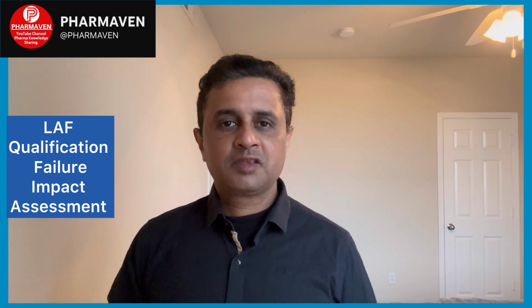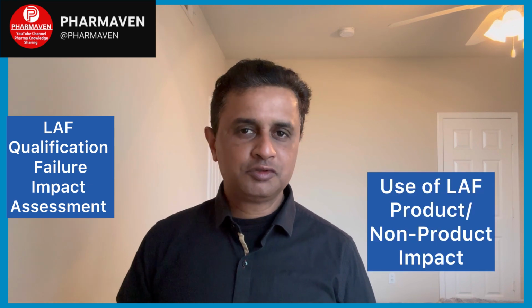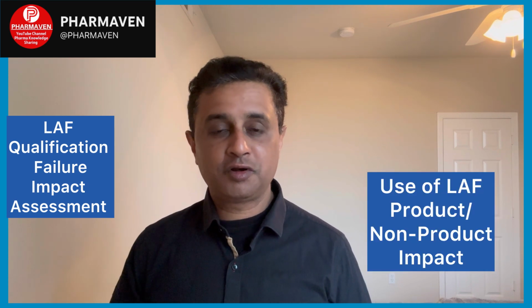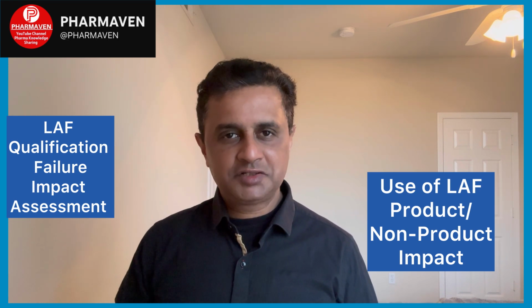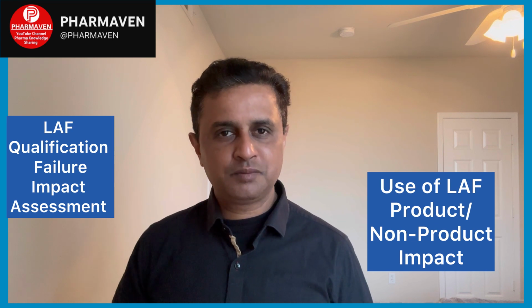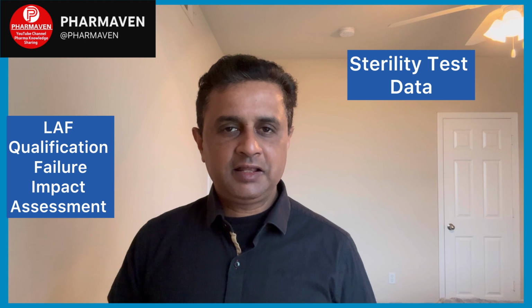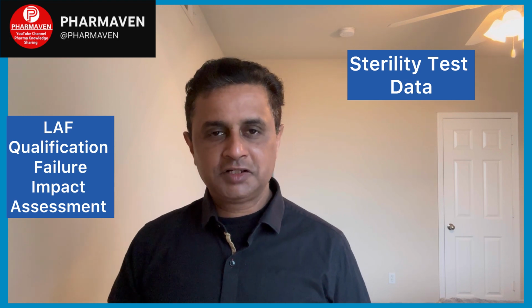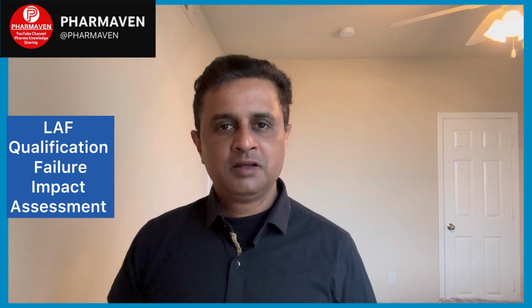Second thing, decide what the use of that LAF was. If the use of the LAF is related to product processing, then review all the batches since the last requalification for the sterility test data, to see whether there is any failure in the sterility testing of the product which was processed under that specific LAF.